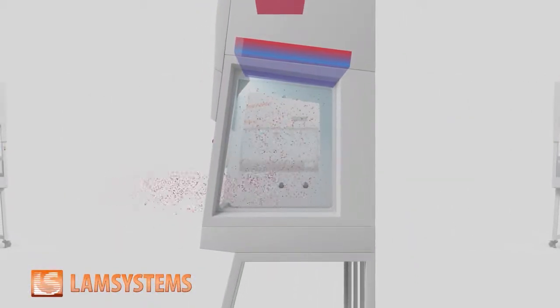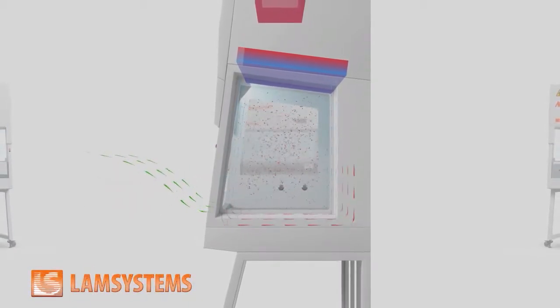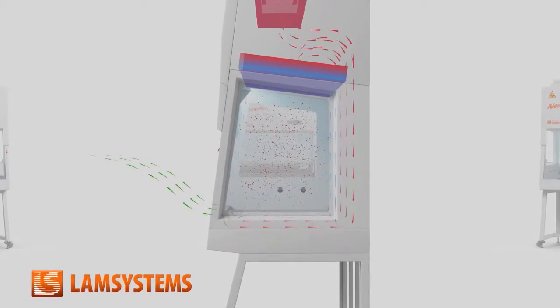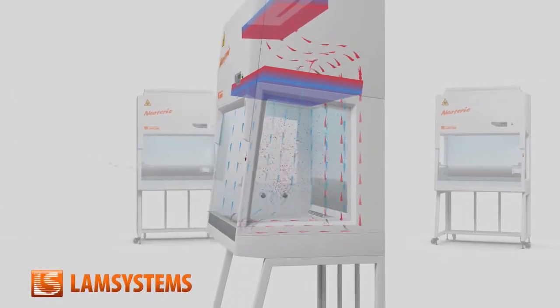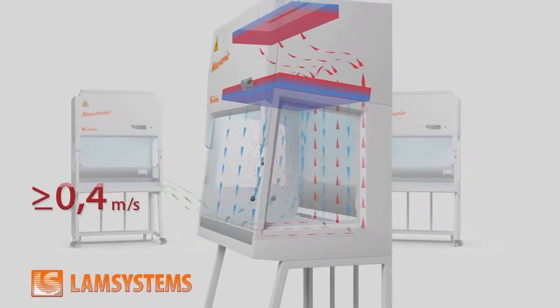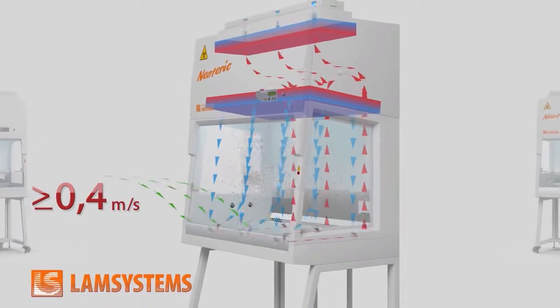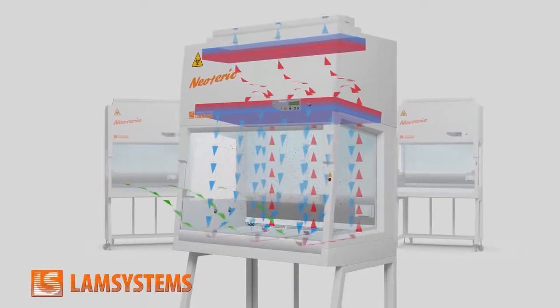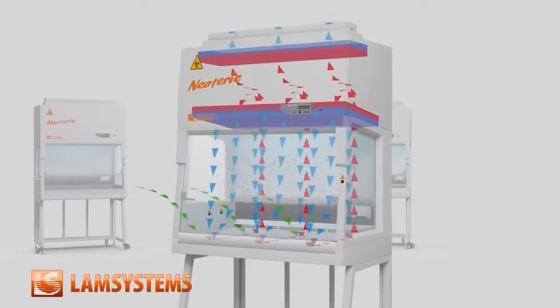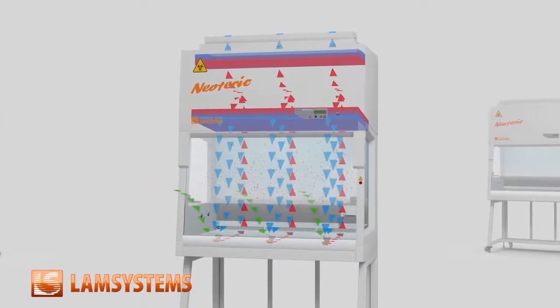An air curtain can be the answer to this problem. It is formed by the airflow forced in by a fan through the front opening into the front air grill. The velocity of the airflow should be constant, and there shouldn't be any barriers which can break the integrity of the airflow. Constant velocity and integrity of the airflow can only guarantee that the air curtain provides effective personnel protection.